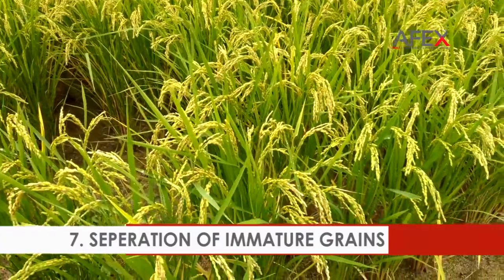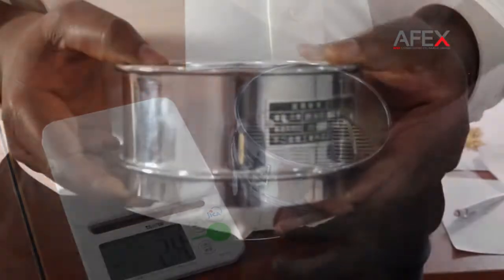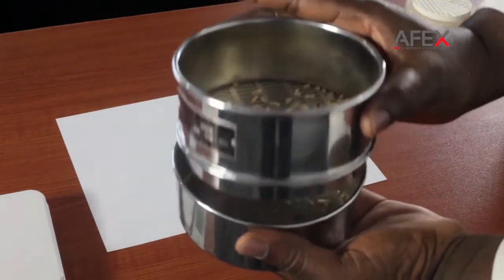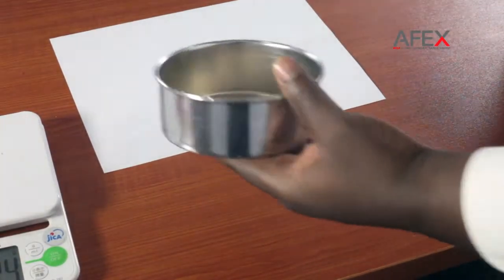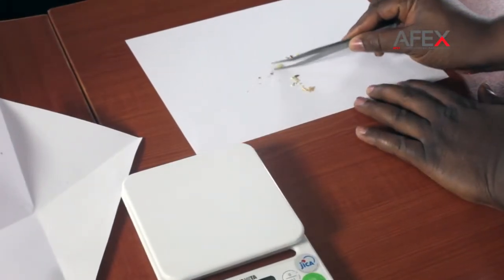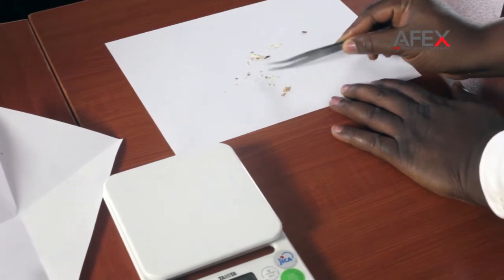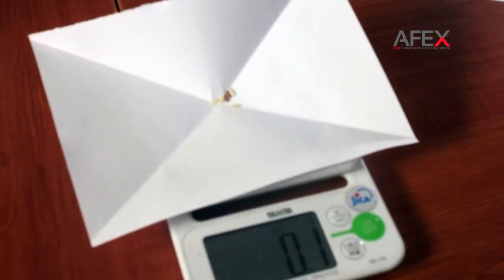Separation of immature grains. Sieve the brown rice for 30 seconds — for most popular varieties in Nigeria — using a 1.6 mm sieve. The rice that goes through the sieve are immature and broken grains. Be sure to shake along the long paddy-shaped openings. Manually separate immature rice from broken rice using the tweezers. Take your time for best results. Broken rice less than half the size of a full grain should not be included in immature grains. Weigh the immature grains and record your results.